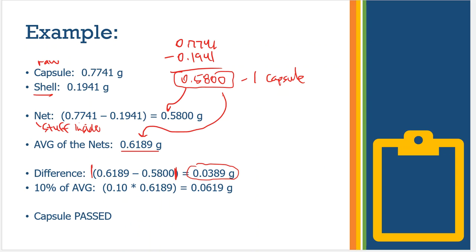It's almost like I'm doing a standard deviation, right? To calculate standard deviation, that's one of the first tasks. You have to take your average first, and then you subtract the individual data point from the average every single time. Now, you do more stuff with it than that, but this looks very similar to that, right?